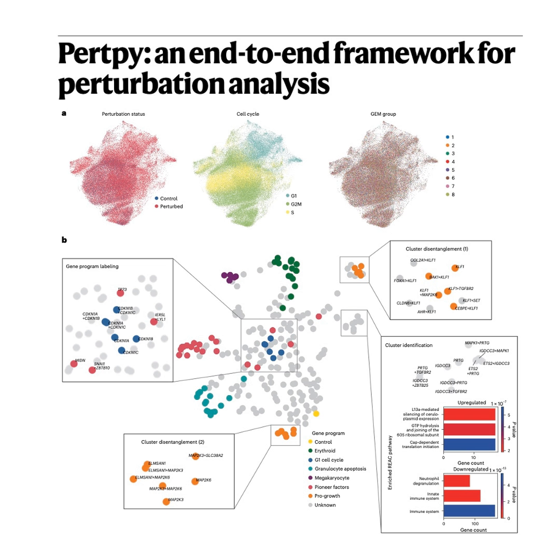And on the advanced end? You have optimal transport-based distances, like the famous Wasserstein distance. The Earth mover's distance. Yes. You can think of it as what's the minimum cost or work required to transform the distribution of cells from perturbation A into the distribution of cells from perturbation B. It's much more sensitive to changes in the shape and density of the data. And I assume you can test if these distances are meaningful. Oh, absolutely. Every single one of these metrics can be tested for statistical significance using Monte Carlo permutation testing. So you can be confident that the difference you're measuring is real. That's a huge amount of analytical firepower.